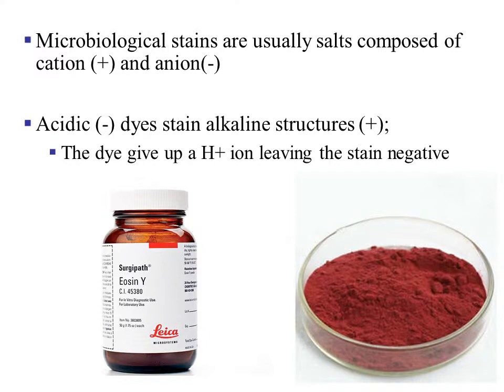Microbiological stains are usually salts, and they are composed of either a positively charged ion or a negatively charged ion. If it is positive, it is a cationic salt stain, and if it is a negative charge, it is an anion stain.